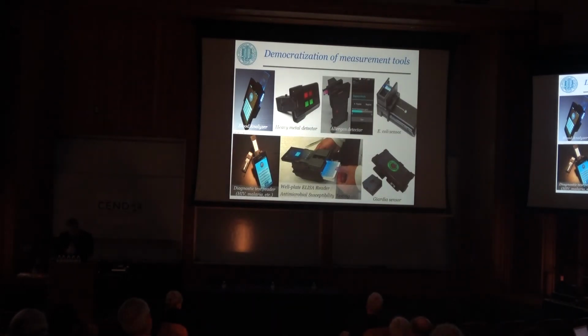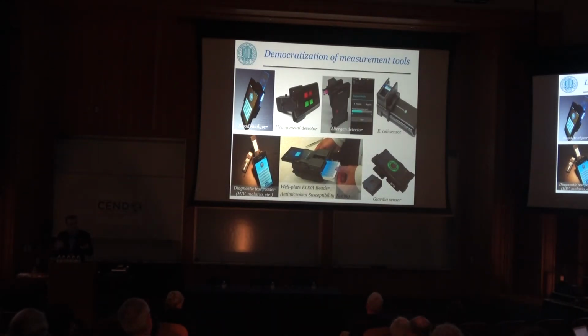So to summarize and conclude, the intersection of computation and optics provides us some very unique opportunities to democratize advanced measurement tools. And I'll give you some examples of that from our lab. For microscopy, the use of microscopic imaging for various different biomedical samples of interest for diagnostics. At the same time, these tools are helping us to be used as sensors, sensory instrumentation, for various different platforms, including 96-well plates or other types of cartridges that are custom designed for the sensing diagnostic test at hand.